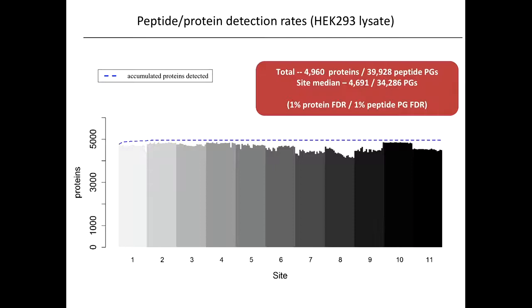And so that means that if you add the data from this site here or from this site here, they do not discover any new proteins or very few new proteins. So basically what they discover is what the others also discover, and that means that the data are highly reproducible. So this would indicate that over these more than 200 runs, the proteins identified in the first run are, to a large extent, of course not completely, but to a large extent also found by other sites, and this is a fairly good indication of a fairly reproducible acquisition method.